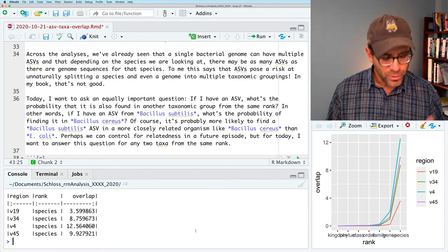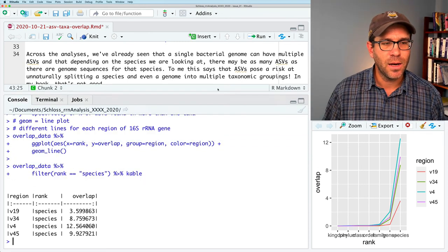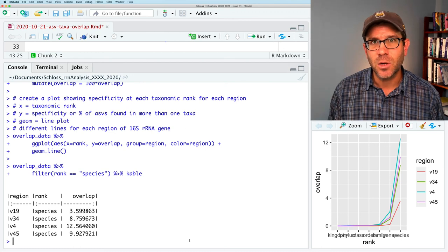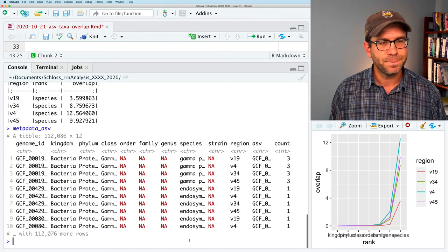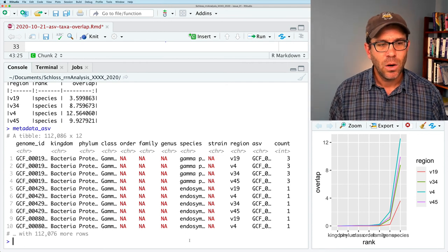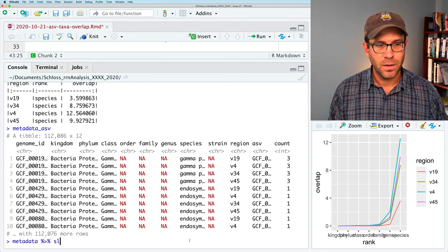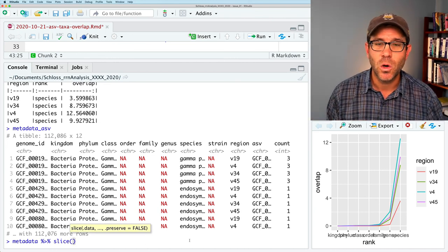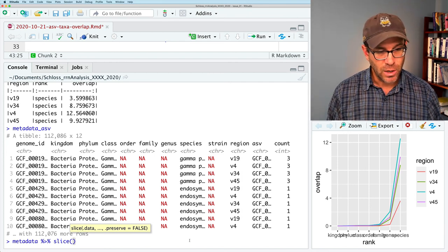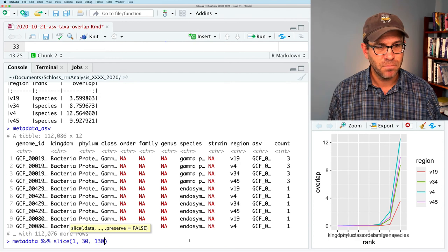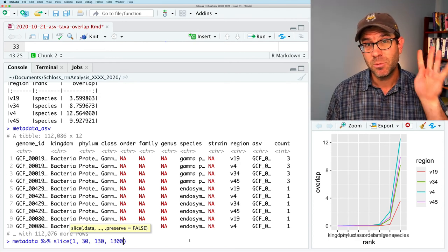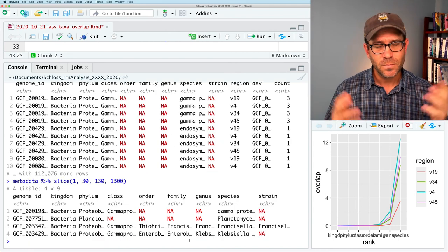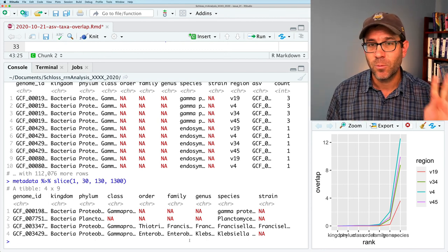To help motivate that, let me show some new commands in the console related to the slice function, which is part of dplyr. If I do metadata_ASV, we see our data frame. The slice function accepts row numbers—so I could do 1, 30, 130, 1300—and the output will be a data frame with those four rows. That doesn't directly help with what we want, but it illustrates the basic behavior.